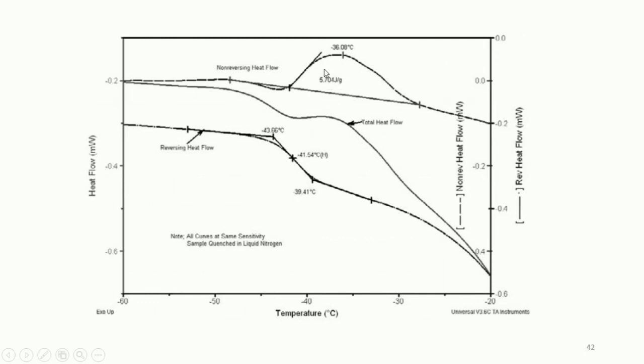Here we can observe the values. It is not surprising that unfrozen water would begin to crystallize near minus 42 degrees Celsius, since this is near the onset of glass transition where a significant increase in molecular mobility and diffusion can occur.